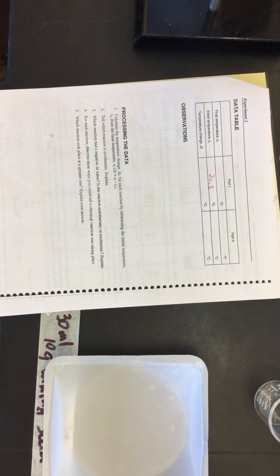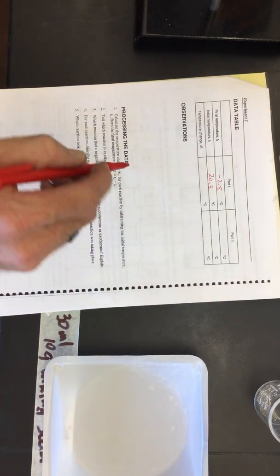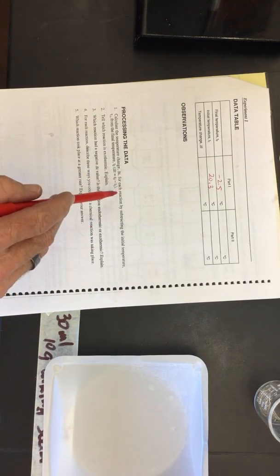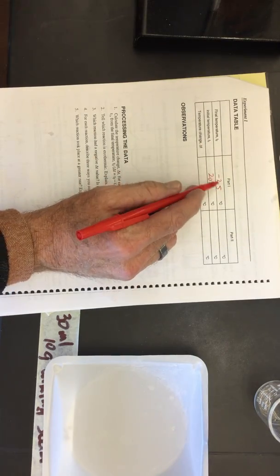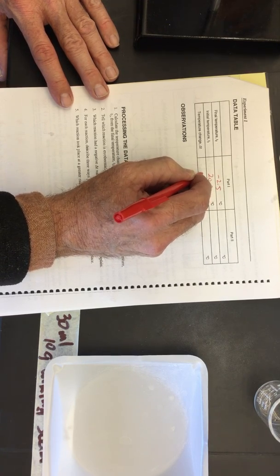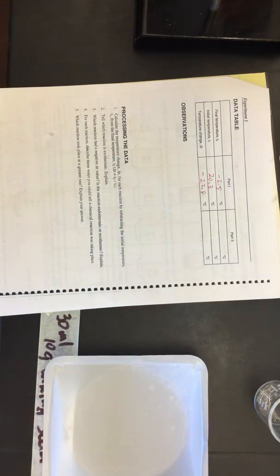The minimum temperature was minus 2.5. So when doing the temperature change, we're going to be taking the T2 minus the T1. Here's the T2 right here, minus the T1. When we subtract this minus this, it gives us a total temperature drop. It dropped minus 22.8 degrees for the duration of that experiment.